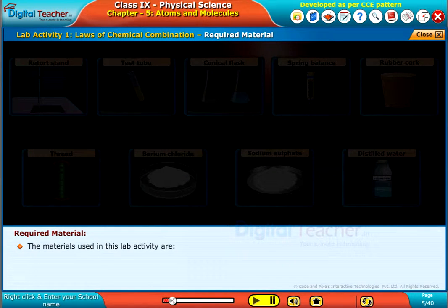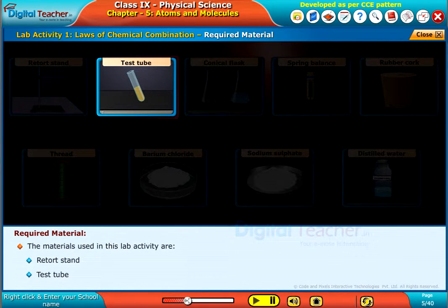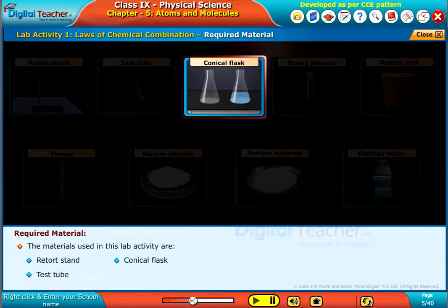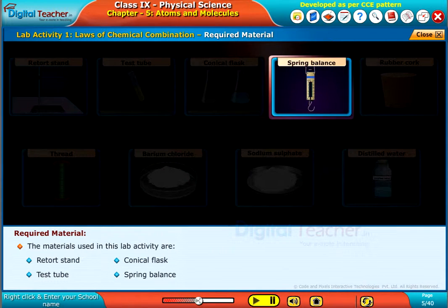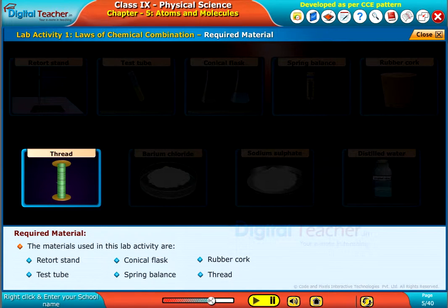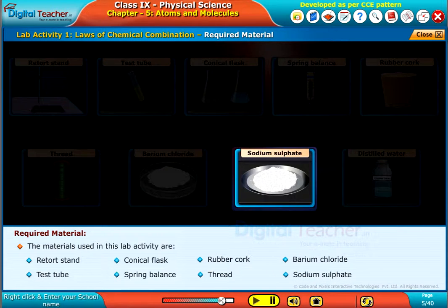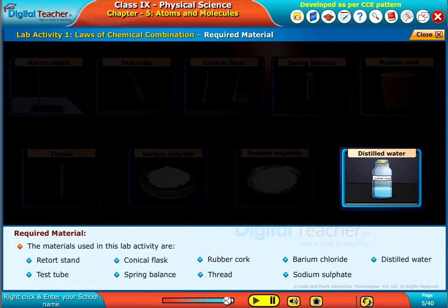The materials used in this lab activity are retort stand, test tube, conical flask, spring balance, rubber cork, thread, barium chloride, sodium sulfate, and distilled water.